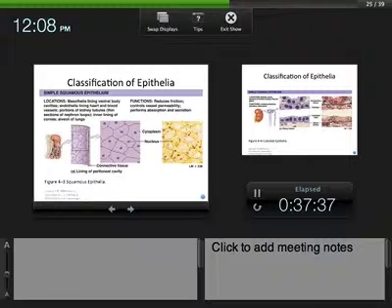Simple squamous epithelium. When you look down on it, it's really just going to look like these amorphous cells, a single layer of them squashed down. We find this in the ventral body cavities as mesothelial layers. It lines the heart and the blood vessels.